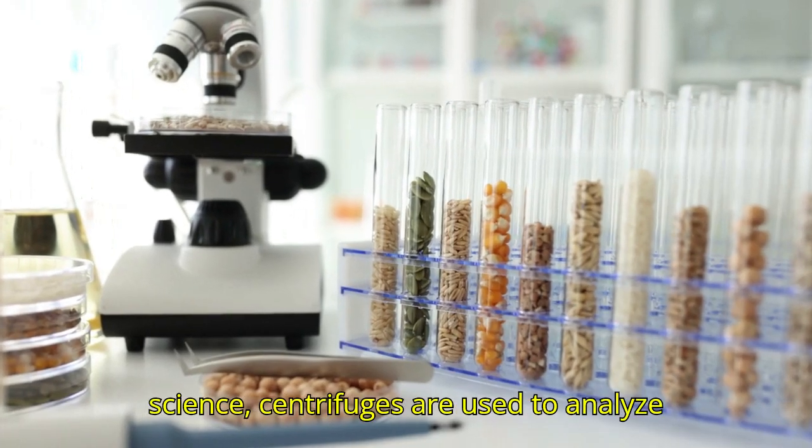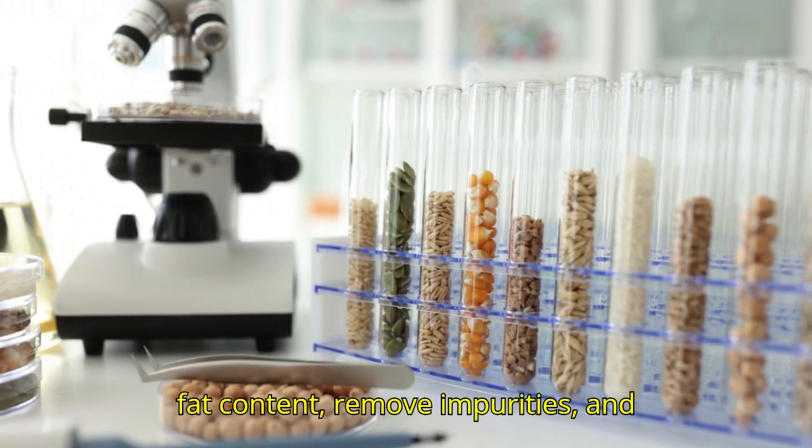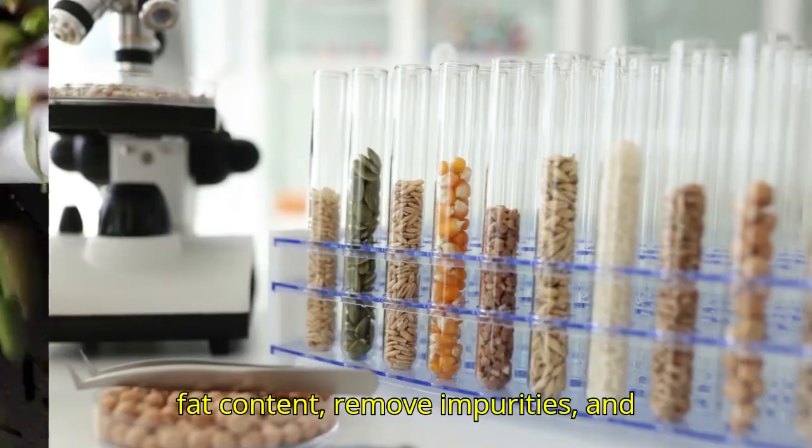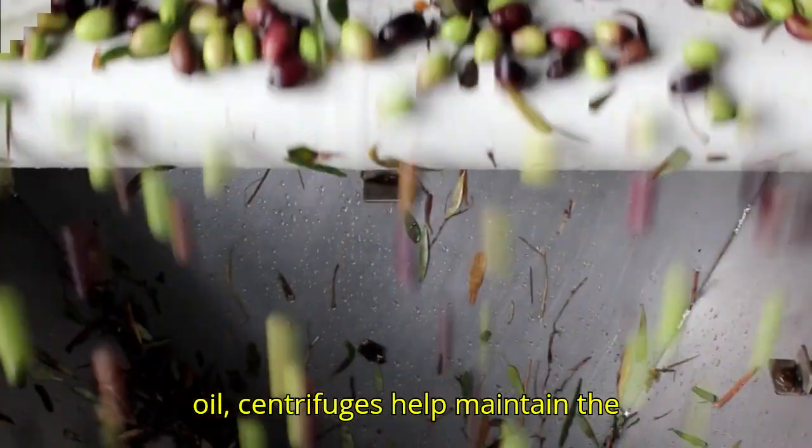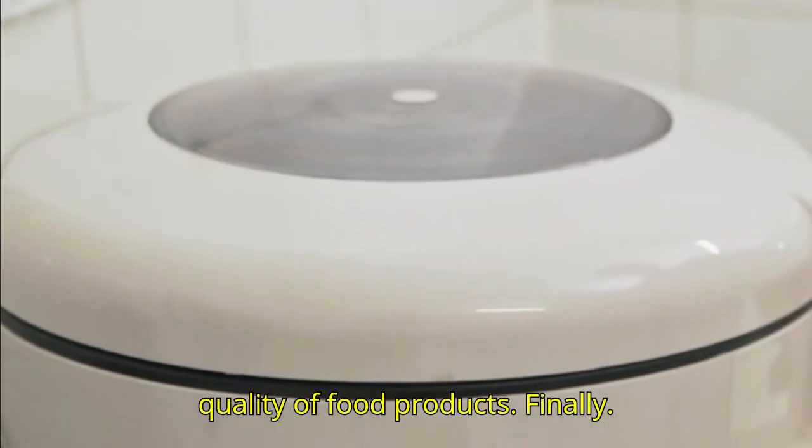In food science, centrifuges are used to analyze fat content, remove impurities, and ensure food safety. From milk to olive oil, centrifuges help maintain the quality of food products.